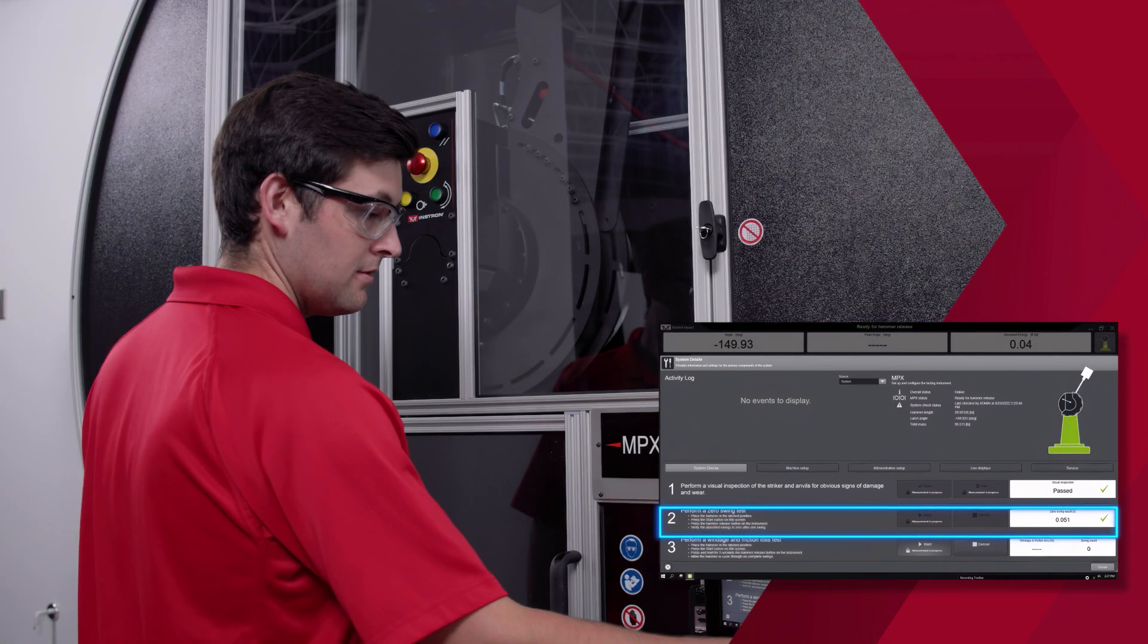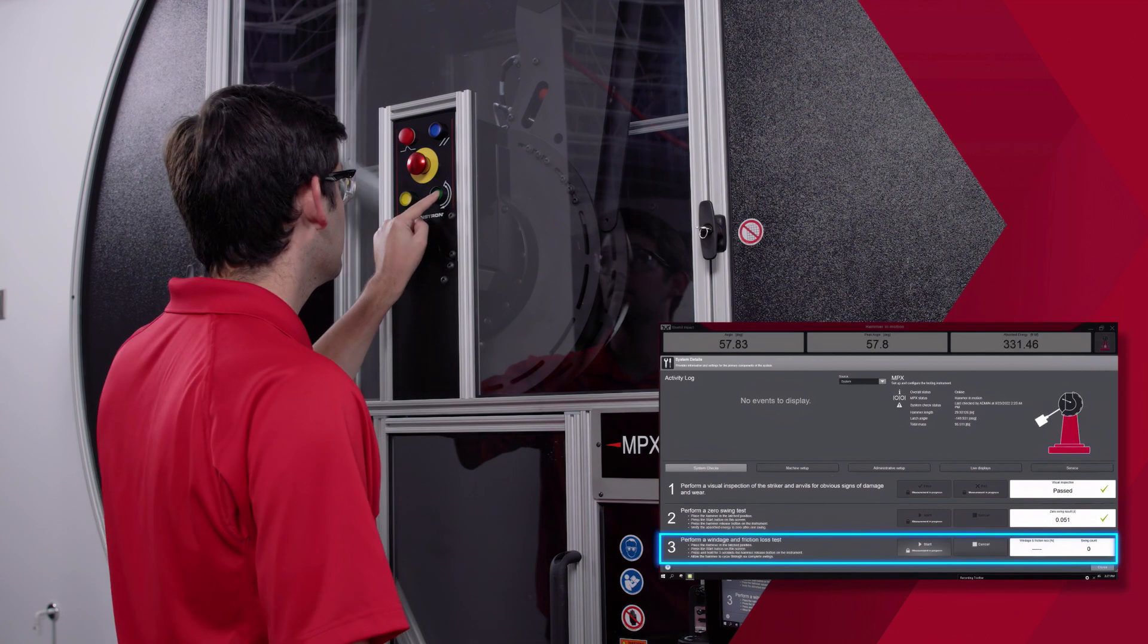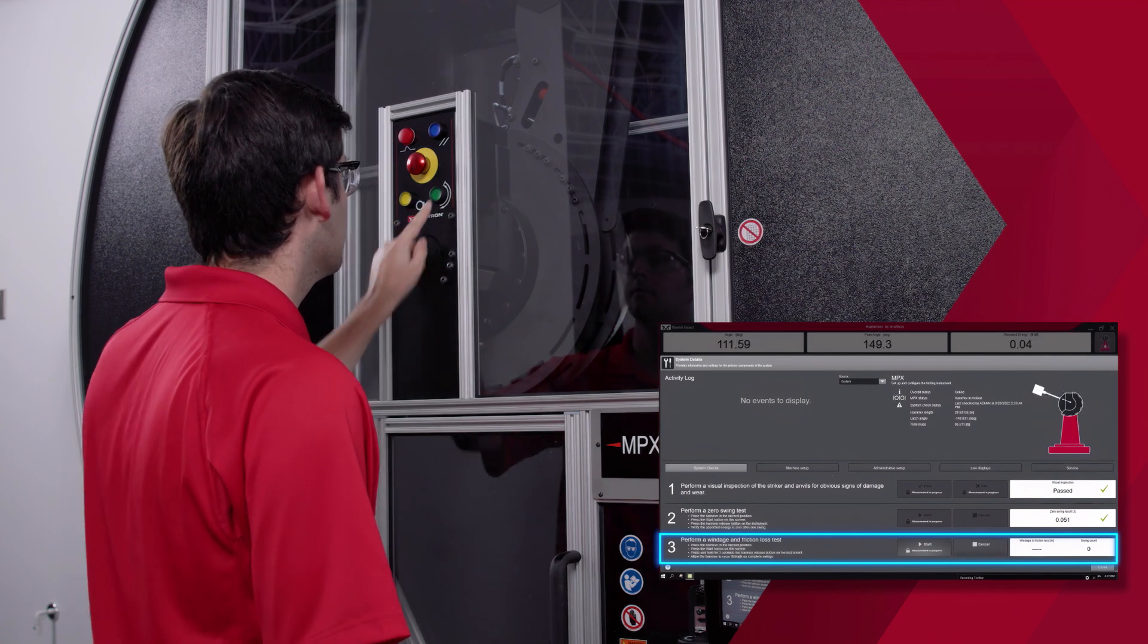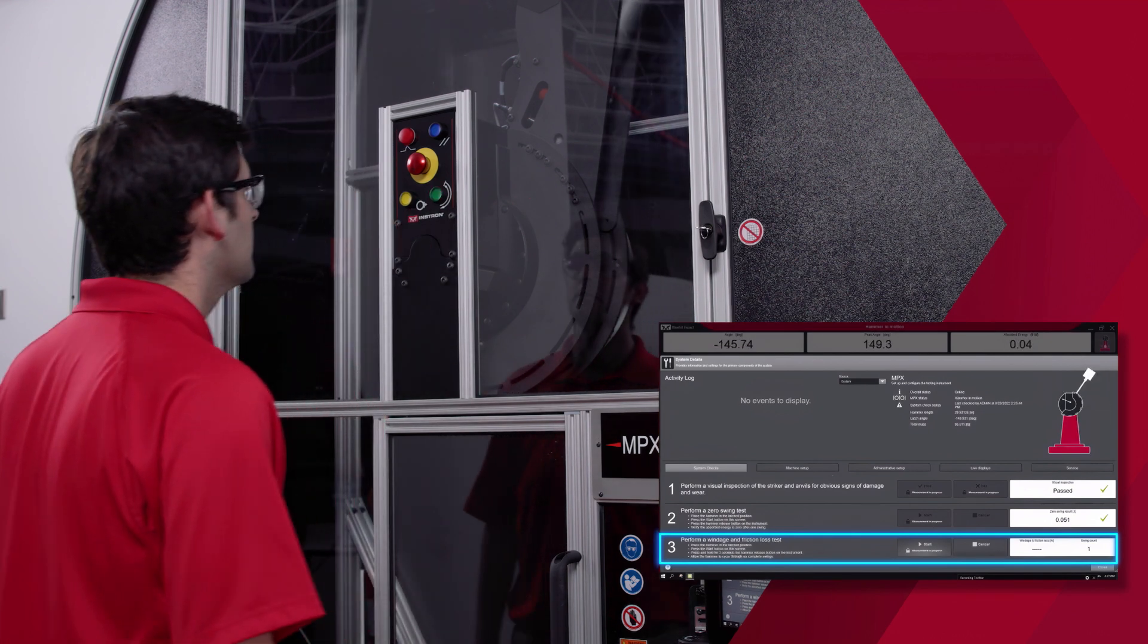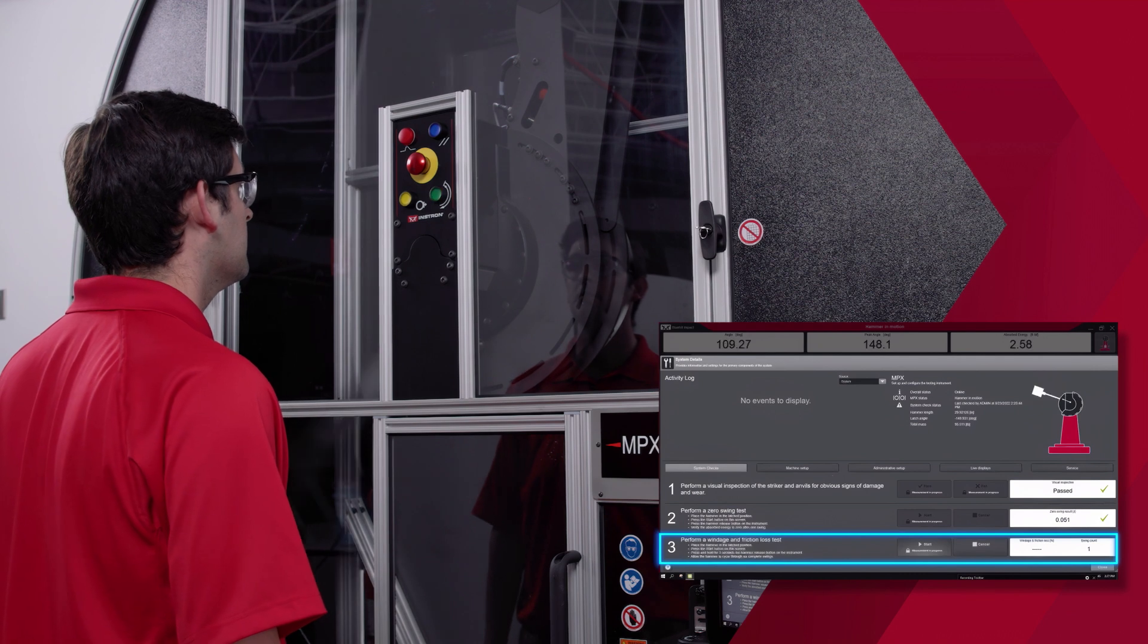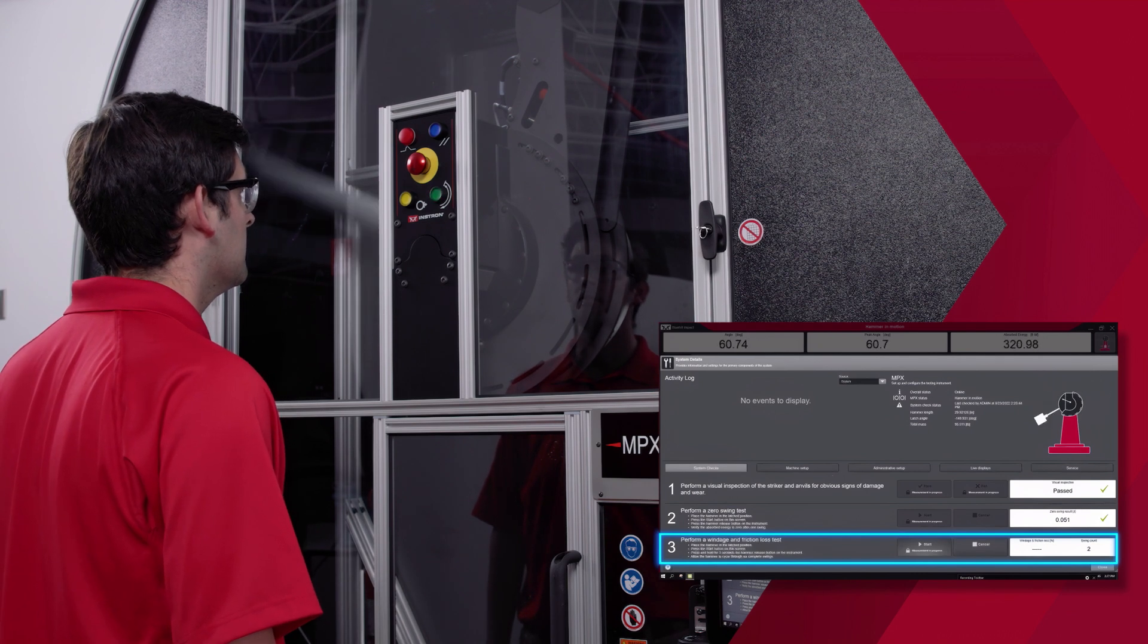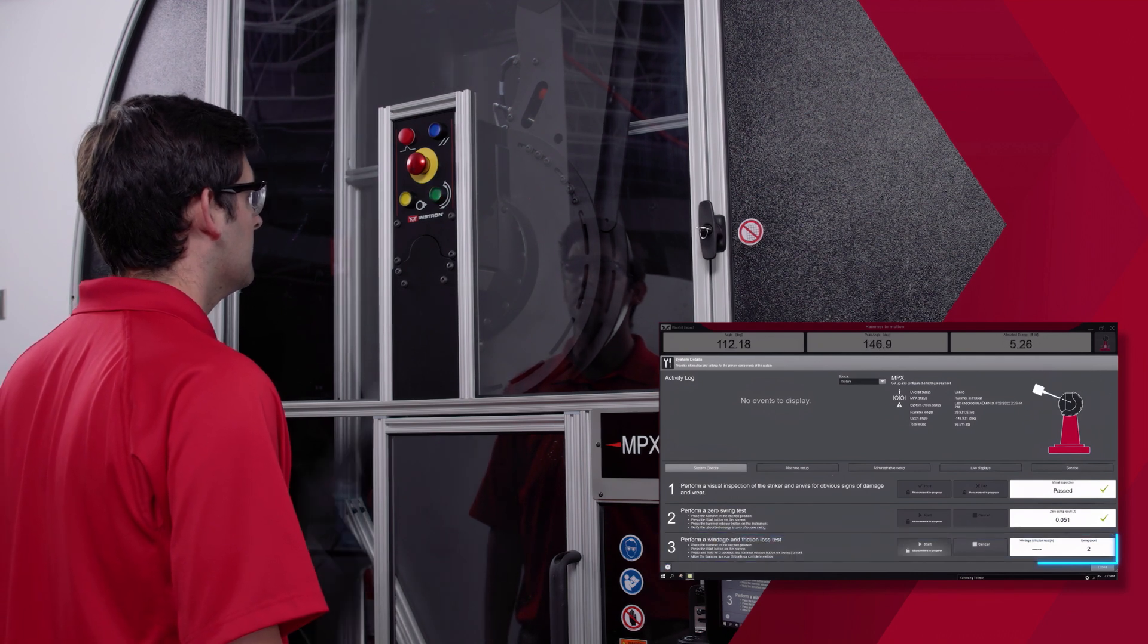And for step three, we perform a windage and friction loss test. You do this by pressing and holding the green hammer release button on the control panel for three seconds, allowing the hammer to cycle through six complete swings.